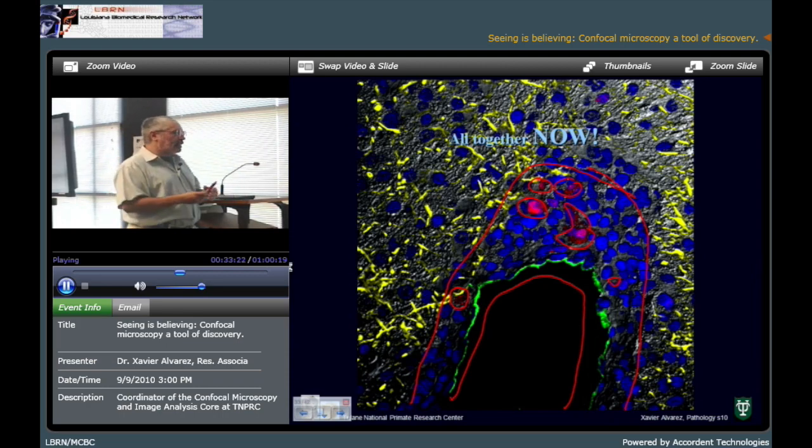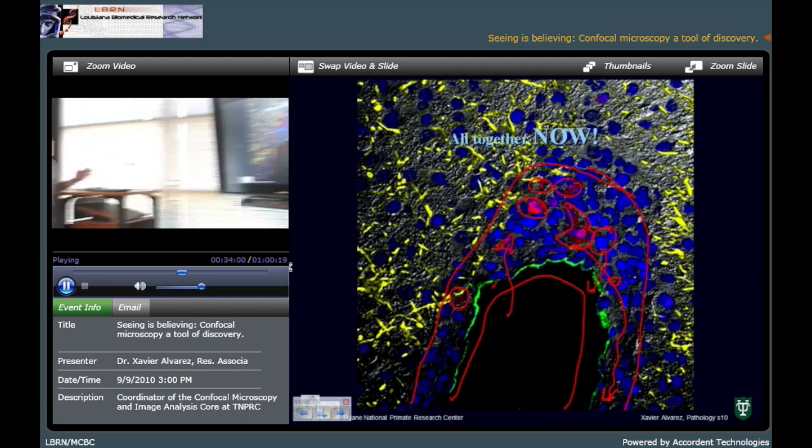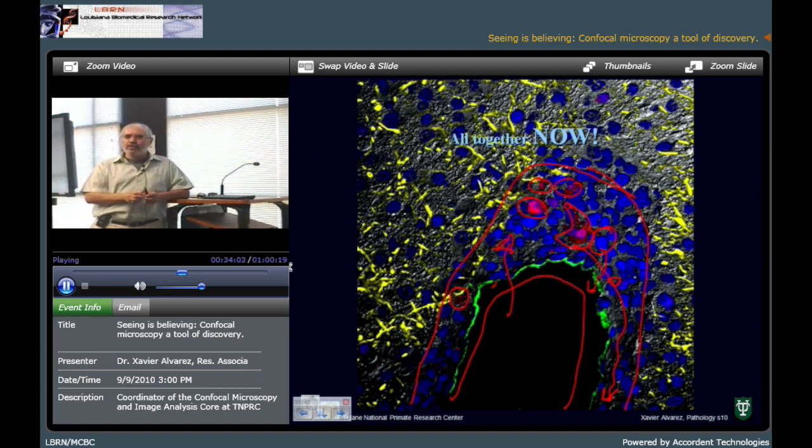One of the things that I'm doing is studying how these cells came across like this. What do they do in order to go there? You could study extravasation of cells into the place of the inflammatory process, or you could ask a more difficult question: are these cells going this way, or are they coming out again? Is this infected cell going to stay there, or going to go somewhere else, or is it protected and becomes a big reservoir of virus?